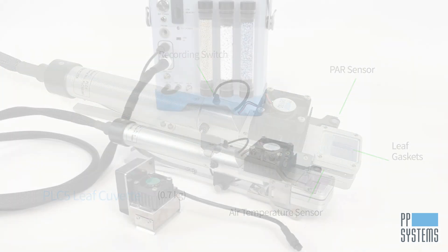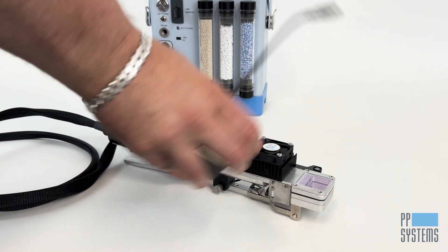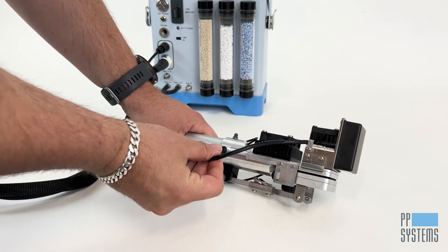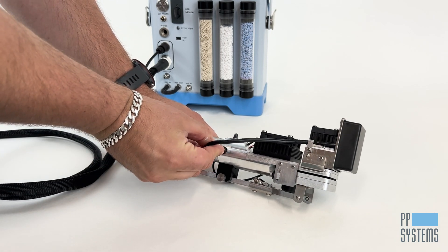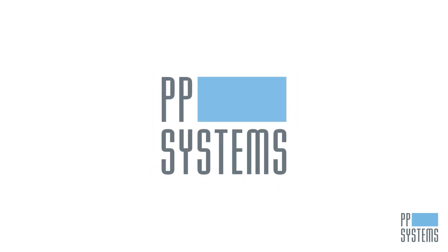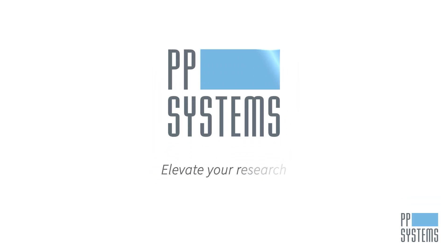Do you need light control? The Targus One's optional LED light unit easily clips onto the head of the PLC5 leaf cuvette and provides control of light intensity up to 2500 micromoles per meter squared per second. Contact us today to learn more about the Targus One portable photosynthesis system.